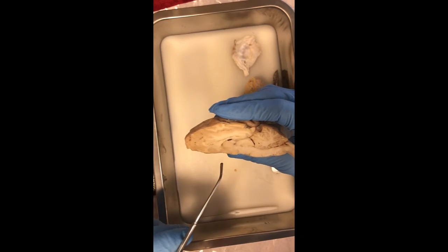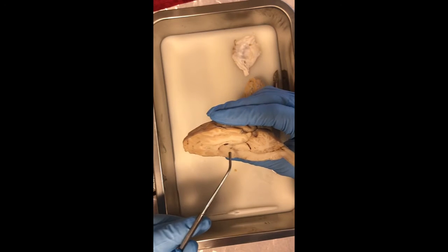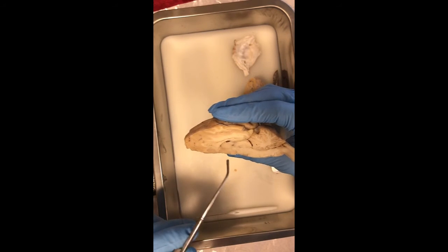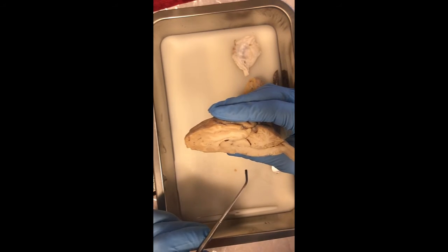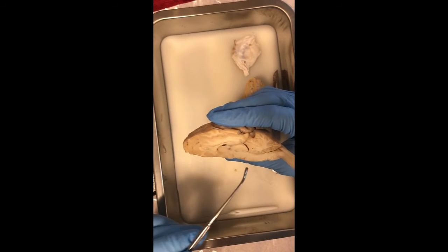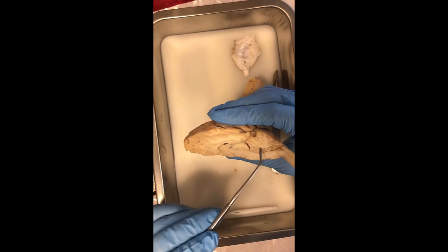After the lateral ventricle, you have the septum pellucidum, which is located here, and then the choroid plexus right here. Then there's the third ventricle located right here, the cerebral aqueduct right here, and then the fourth ventricle is going to be located about right here with the arbor vitae, this white matter right there.